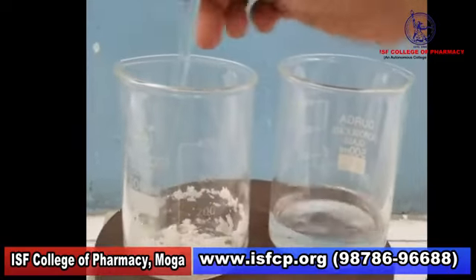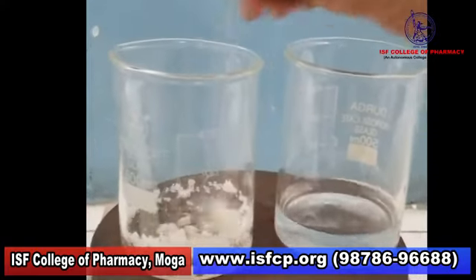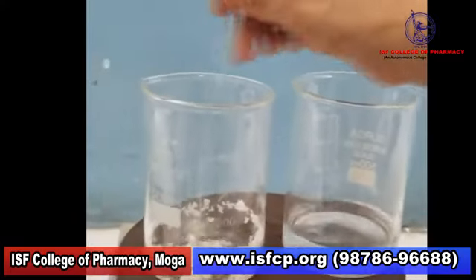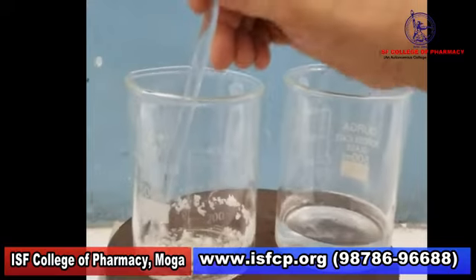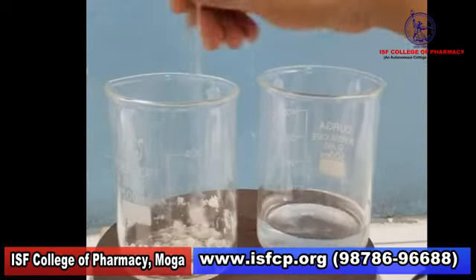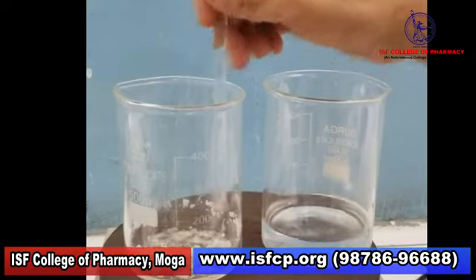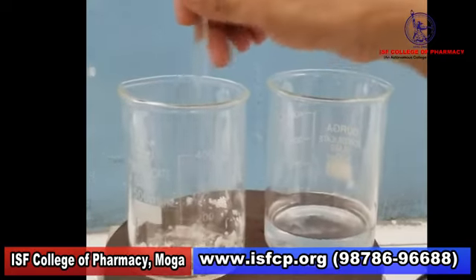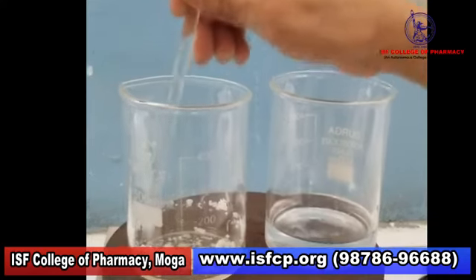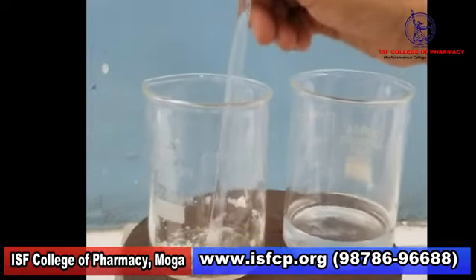The advantage of using this order of mixing is that the highest melting point ingredient acts as a solvent for the rest of the ingredients, and overheating of the ingredients is avoided. So here we will wait till the stearic acid melts completely, and then we add the next ingredient, stearyl alcohol. And make sure that when we are doing it, all the ingredients melt.